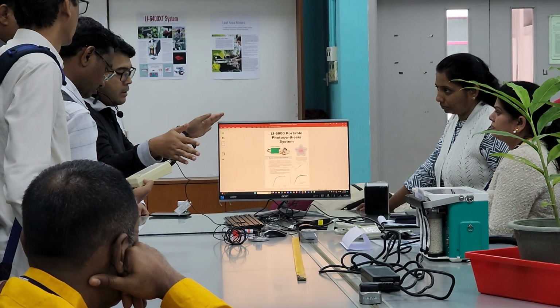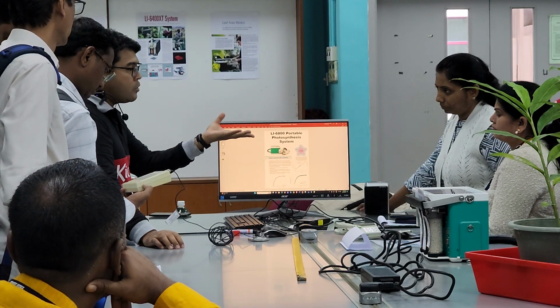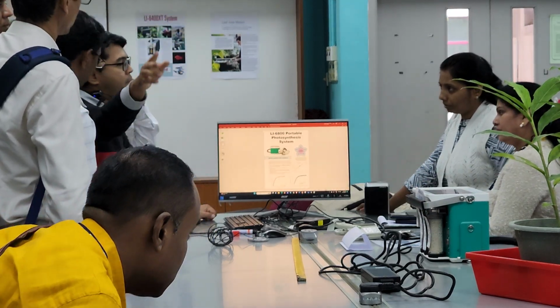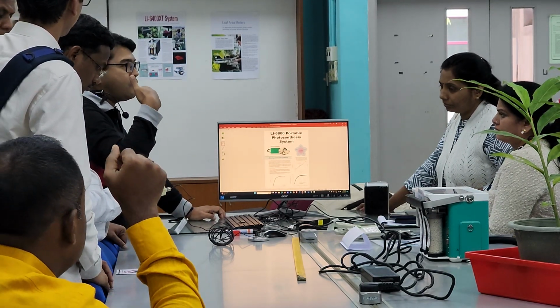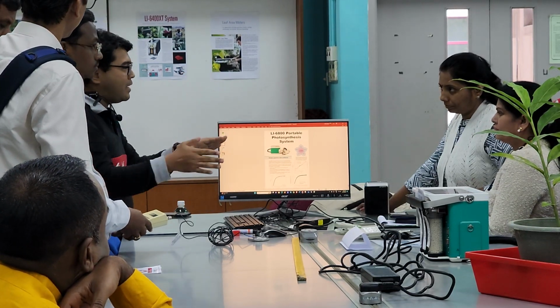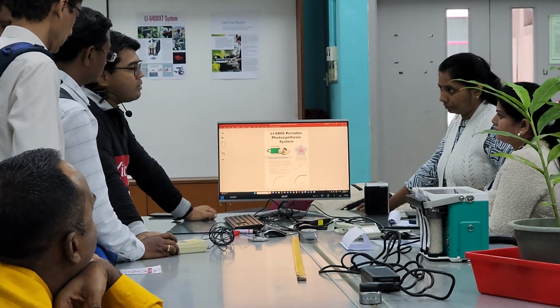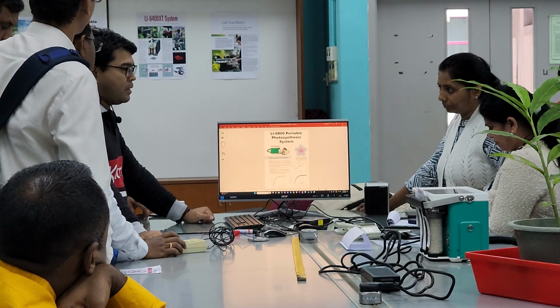Spread it throughout the entire day, maybe every hour or so during the photoperiod, so that you get a good light profile. In Malaysia we are tropical, so it's about 12 hours. Maybe in your country, in winter time, you have a longer night and less day, so the reading is a bit different.